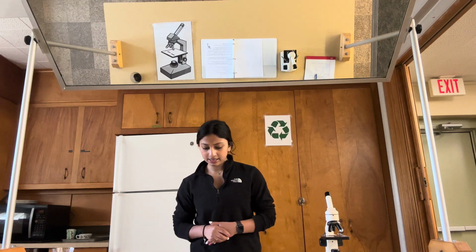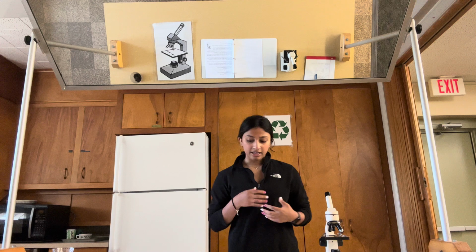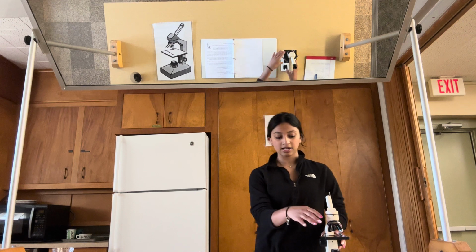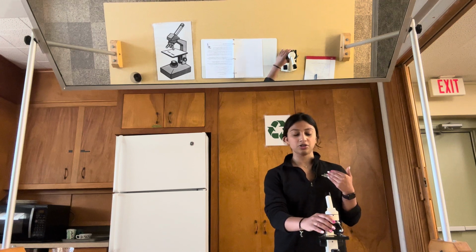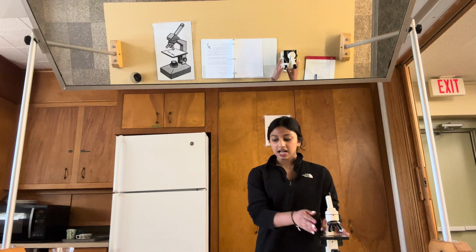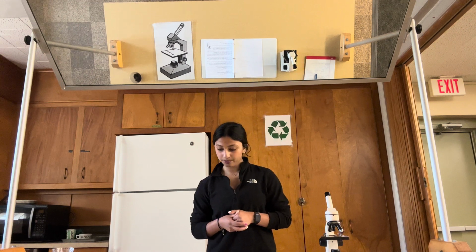The body is the tube and allows the light to pass upward to where the user's eye is. And the lens is the eyepiece that usually has a magnification of 10x. This microscope begins at a power of 4x and goes up to 40x. The stage is the platform that supports the specimen to be observed. The stage has a hole in its center to allow the light to pass through, so specimens can be positioned over the top of the hole.